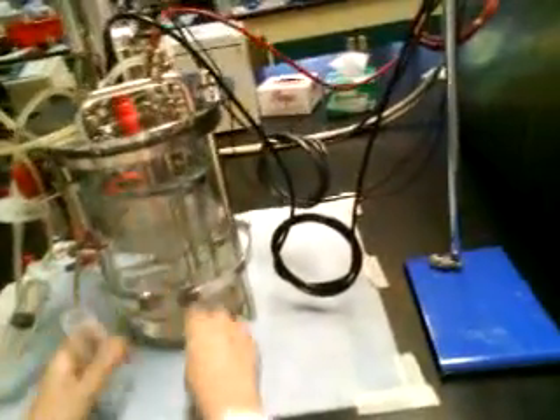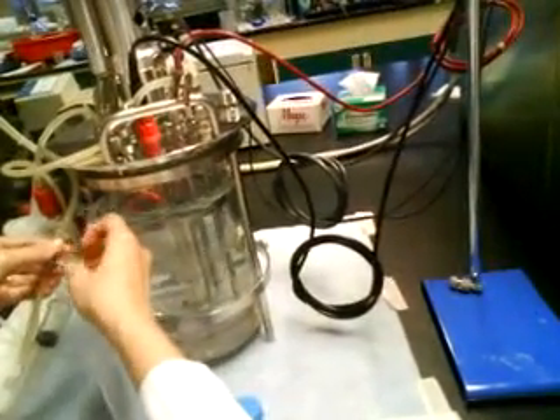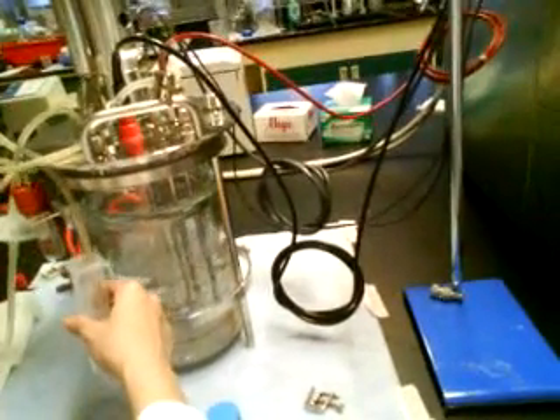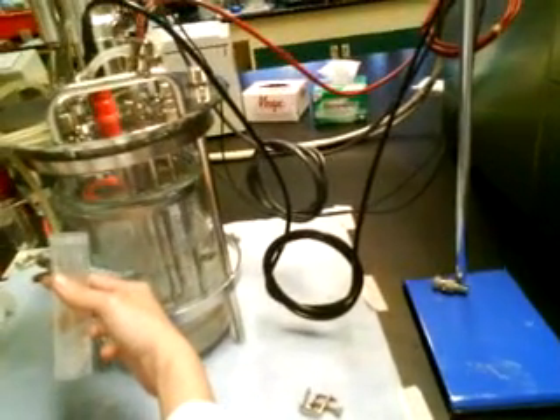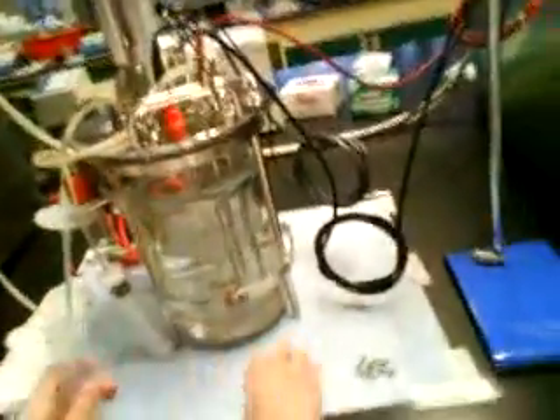So the next thing is you can open this up, unscrew this clamp. Put your tube in, and then you pump it in. It will be collected here. So in this way, your reactor will still be sterile.